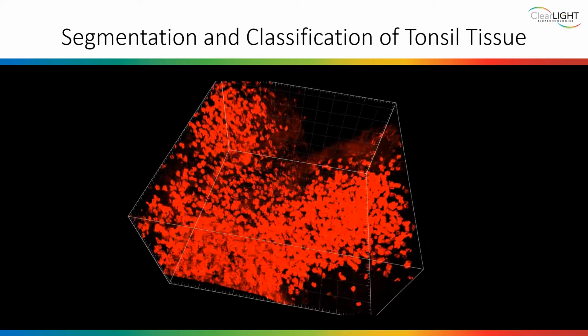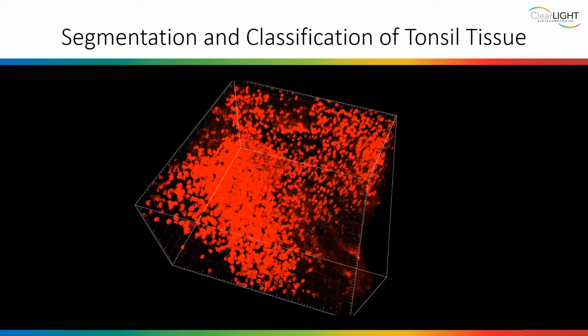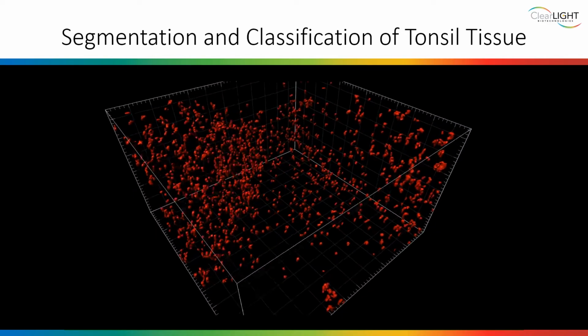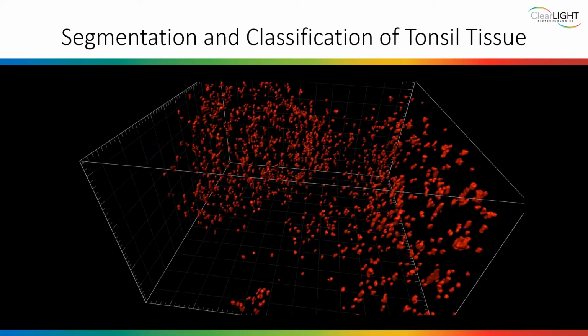Altogether, this AI method provides the information required for a thorough characterization of the spatial distributions and morphological properties of all the cells within the image sample, as well as the classification of different cell types revealed by the biomarkers employed.